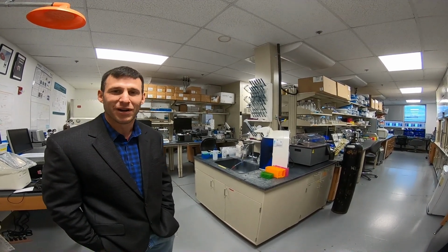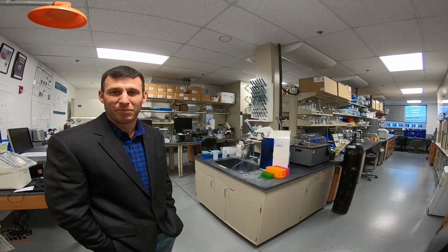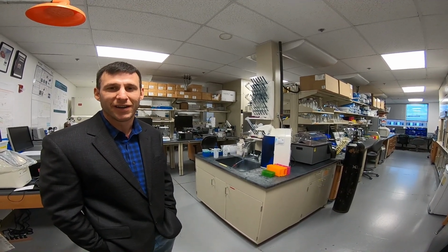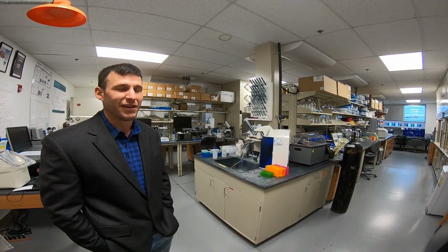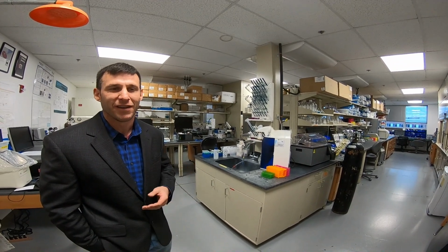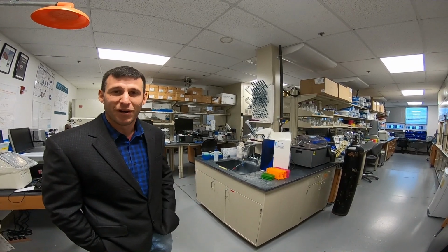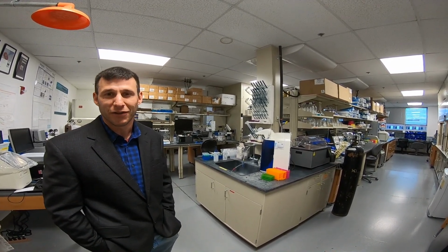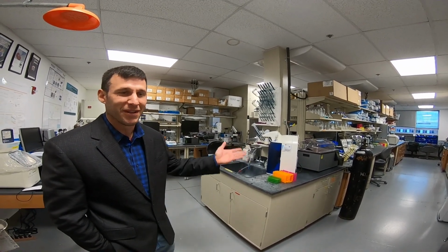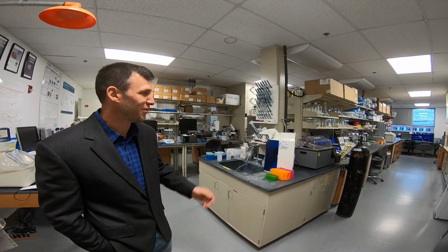And some of the main process analytical technology that we focus on developing in our lab is biosensors and chemical sensors. Essentially those are tools that we can use to quantify and identify molecules. And in biomanufacturing applications, one of the critical quality indicators of process quality, and in fact some of the products that we're trying to make, are on a molecular scale. So the ability to quantify, identify, and detect molecules and biomolecules is of particular importance in this field. So let me take you around the lab and show you some of the critical technologies that we have here. And so we'll proceed with the tour.